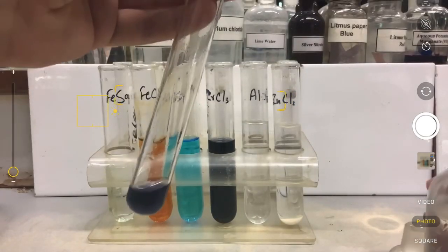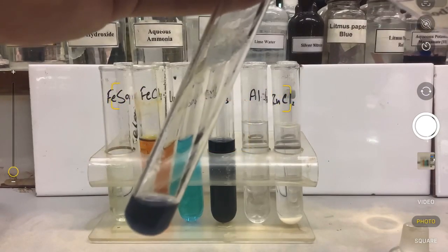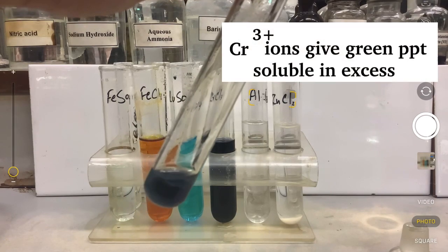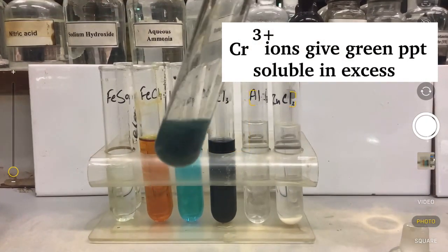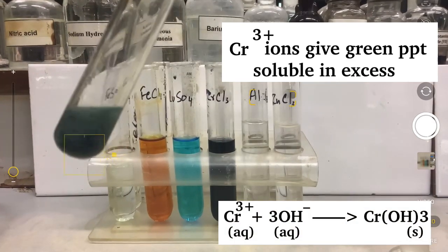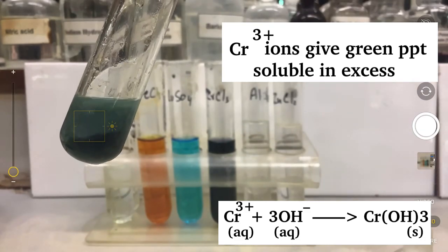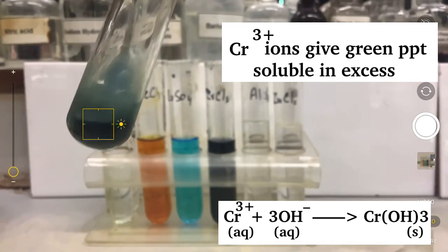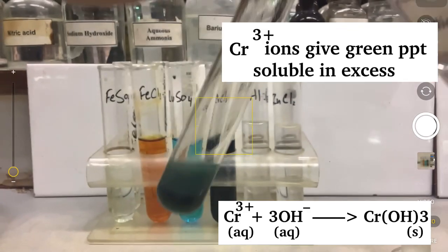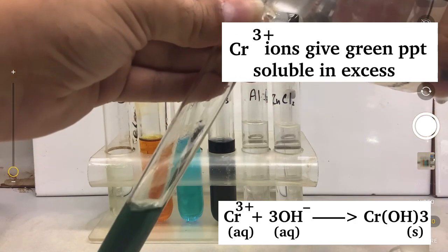When you add aqueous sodium hydroxide, drop by drop until a change is seen, you will see that precipitates are made, and these precipitates are gray-green in color. They are green definitely, but they are not iron 2 green, so they give you green precipitates which are definitely a little different than the iron 2 color. The reason is that chromium ions react with hydroxide ions and they make chromium 3 hydroxide.